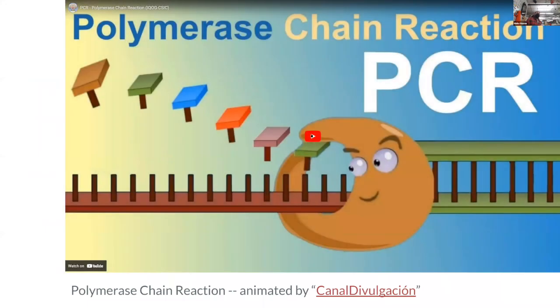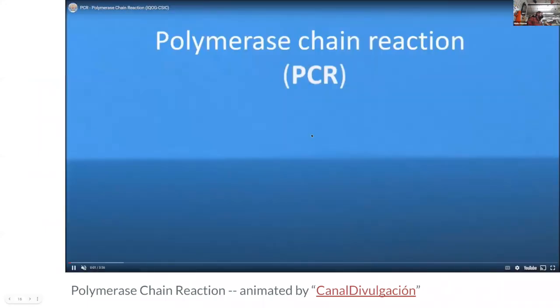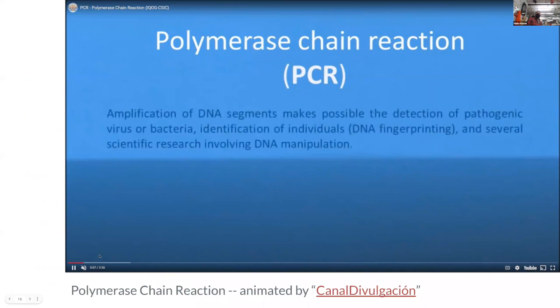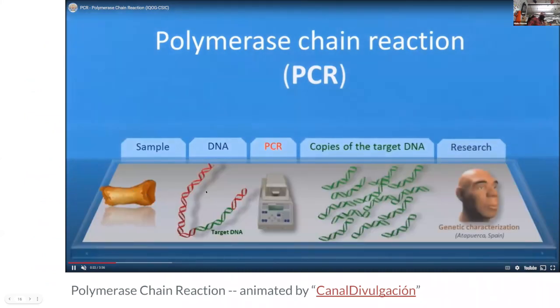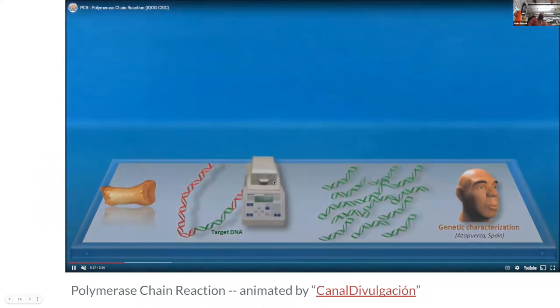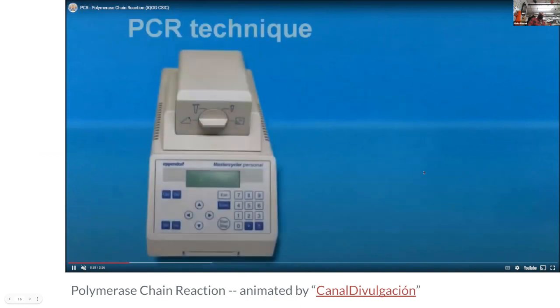In order to try and make sense of this, here's a video that I'm just going to talk over because it's way easier to see it happen than to have a still graphic. Also, this is done by a brilliant research group. This video deserves a ton of credit, so we're just going to sort of show off really quickly. You'll have some sample, you'll do a DNA and then a target DNA, then we'll do this copying thing. You'll have a whole bunch that we can go through.